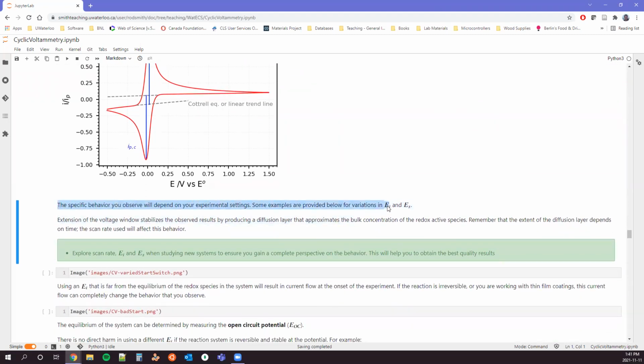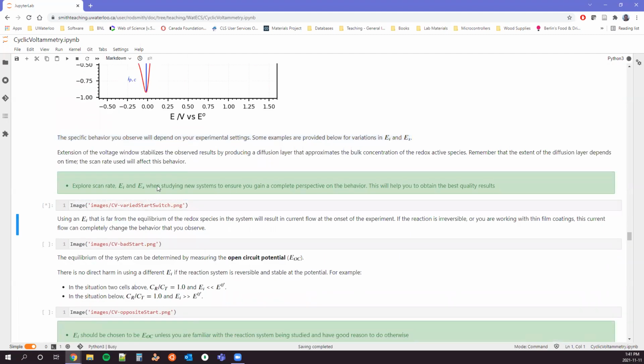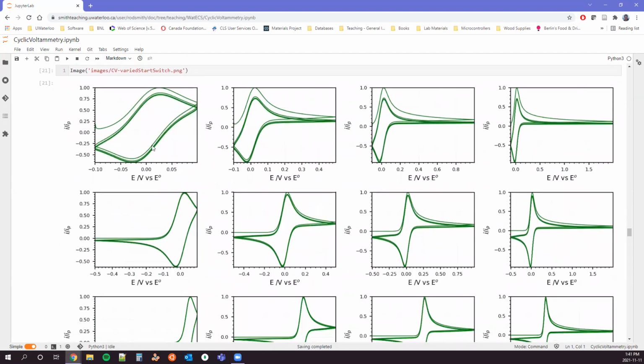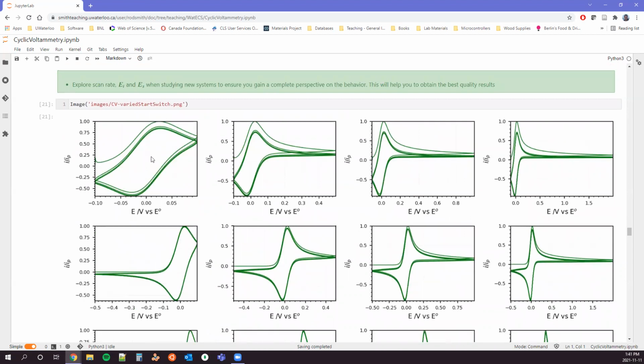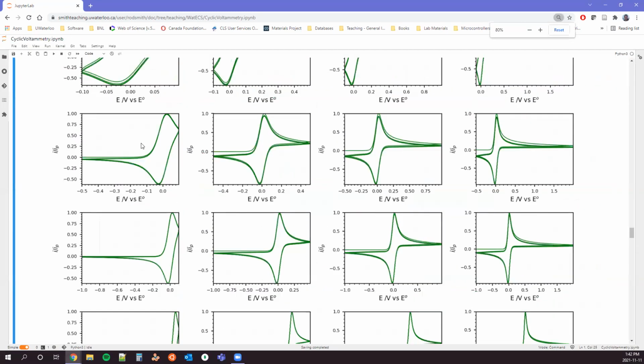What you can expect to see is going to depend on how you probe the system, right? Scan rate's one, but also the initial and the switching potentials. You can kind of see that here in how steeply changing these diffusion layer currents are. And so we can look here at variations. It's maybe a big complex plot, so let me zoom out a little bit so we can see it all at once.